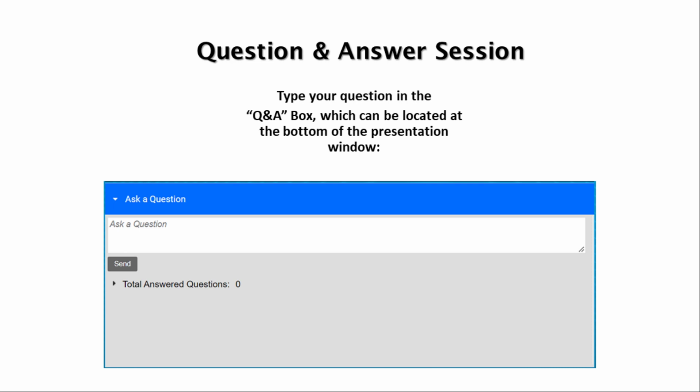And talking about some of the additives that you've explored, did you look at ammonium formate or formic acid additives? Yes, we did look at that. I didn't present the data here, but I'd be happy to share the paper where we looked at those additives. Okay, great. Maybe we can ask the viewers if anyone is interested in that paper that they can follow up. I know you mentioned a connect feature at the end of your presentation to contact, but that would be great that you'd be able to share that with those parties that are interested.